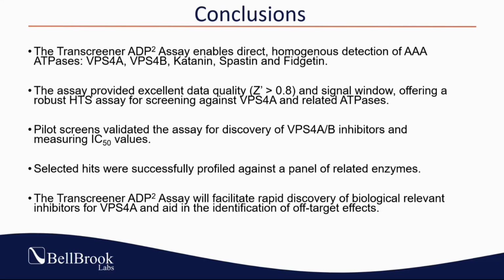And we had a good signal window in each of these assays. What this means is that this presents a really robust system for scaling to high throughput screening levels, for doing large scale screens for new compounds against VPS4A and related enzymes.